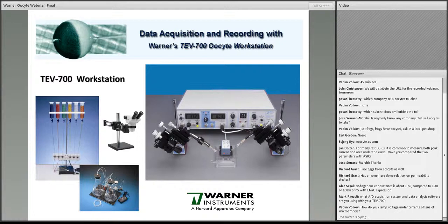Okay. I showed the example of ENaC expressing only a single subunit because it really illustrates how much you can do with this technique. When we were cloning the channel, the first subunit generated a very small current. It's an inward current that transports sodium, and the channel is constitutively active. So obviously 50 nanoamps of current or 20 nanoamps, you cannot see them. They are blended in the endogenous currents of the oocyte.